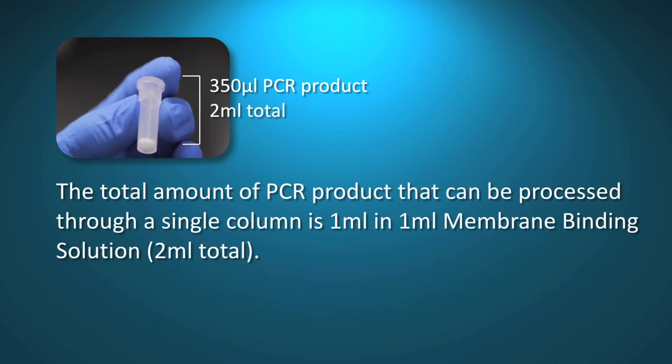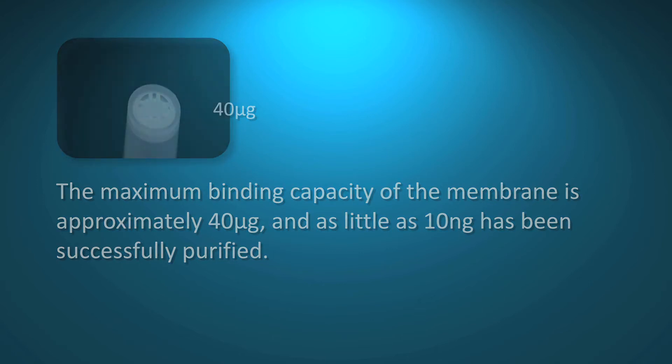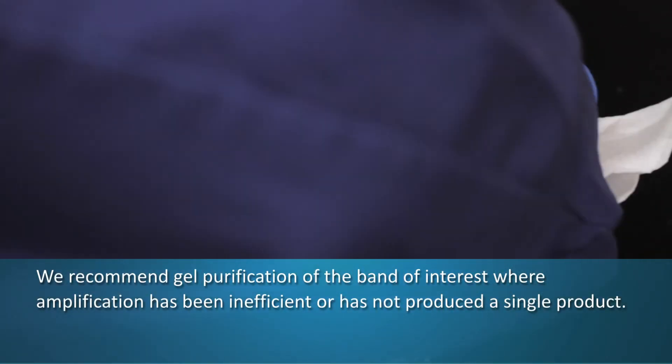In one milliliter of membrane binding solution, a total of two milliliters. The maximum binding capacity of the membrane is approximately 40 micrograms; as little as 10 nanograms has been successfully purified. We recommend gel purification of the band of interest where amplification has been inefficient or has not produced a single product.